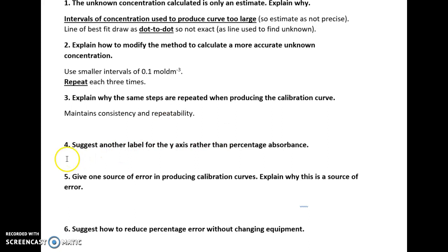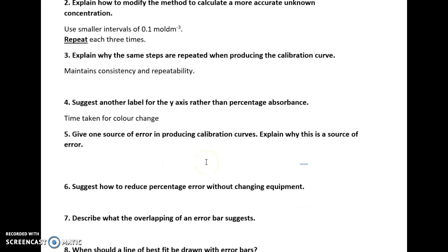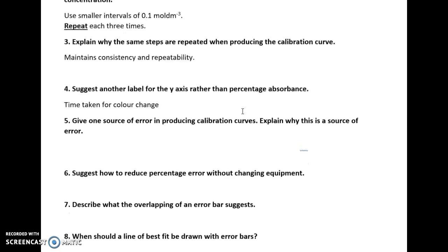Suggest another label for the y-axis rather than percentage absorbance on the curve, and that could be the time taken for the color to change. So rather than just measuring the absorbance, it could change from being red to blue or red to colorless or whatever if we use an indicator of some sort in it.